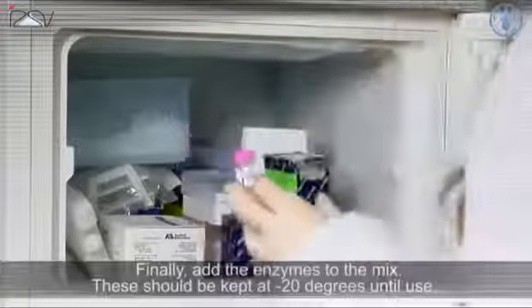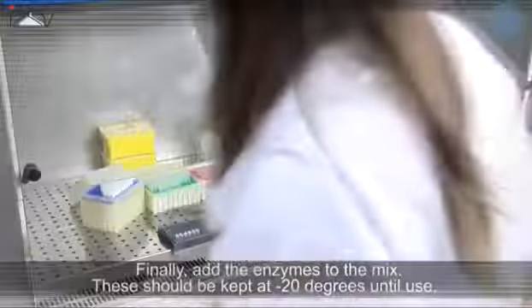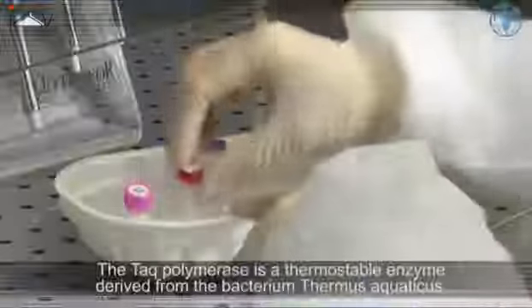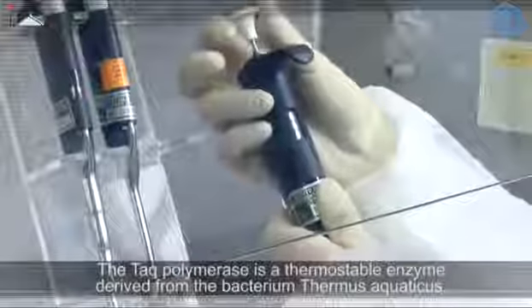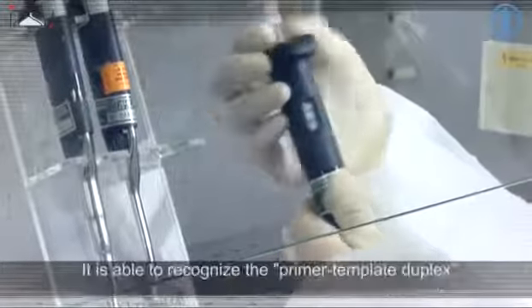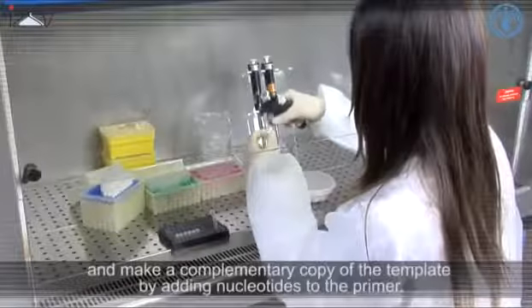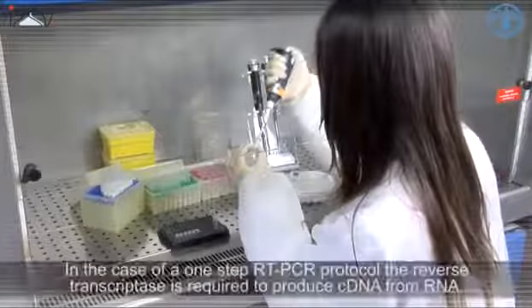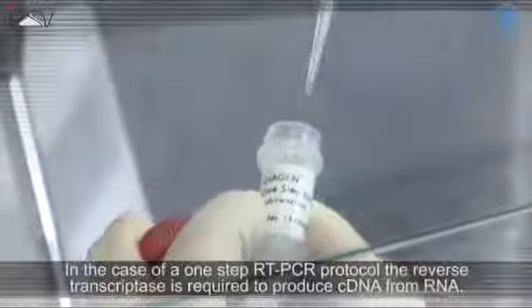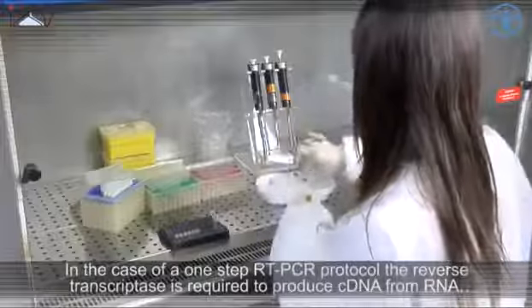Finally, add the enzymes to the mix. These should be kept at minus 20 degrees until use. The Taq polymerase is a thermostable enzyme derived from the bacterium Thermus aquaticus. It is able to recognize the primer-template duplex and make a complementary copy of the template by adding nucleotides to the primer. In the case of a one-step RT-PCR protocol, the reverse transcriptase is required to produce cDNA from RNA.